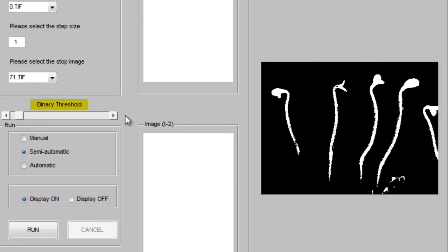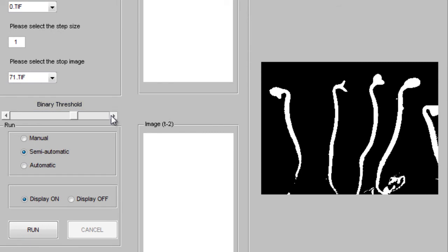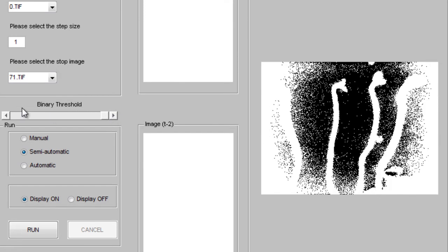Next, adjust the binary threshold parameter. Drag the slider to the right to make the seedling image lines as dark and sharp as possible, but without creating background noise.